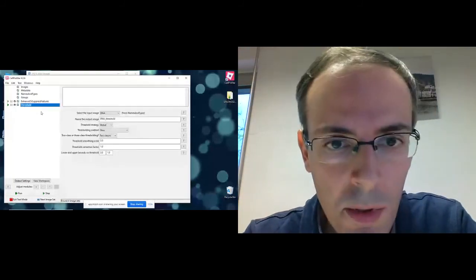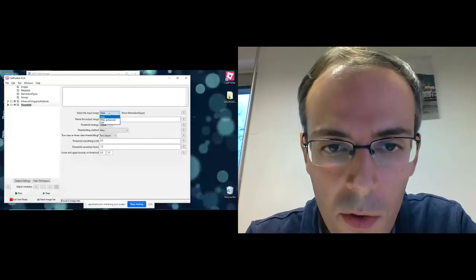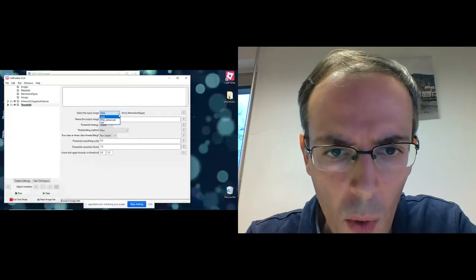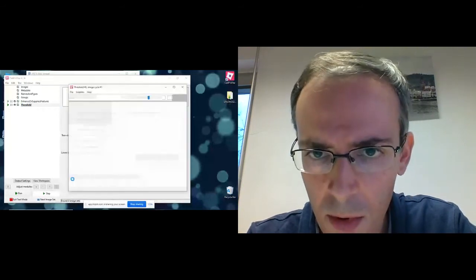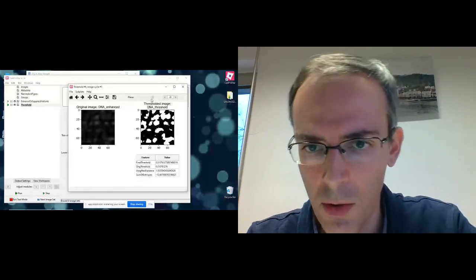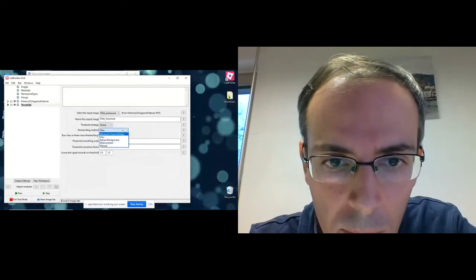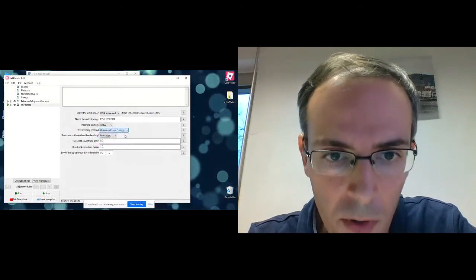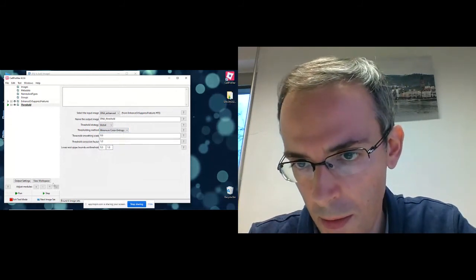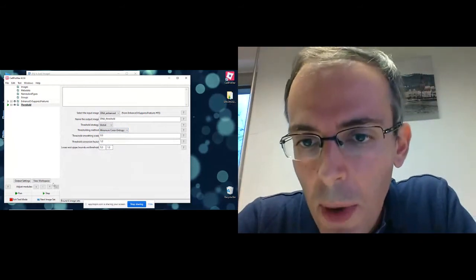So threshold. This time around, we don't want to threshold the raw DNA image. We would much rather want to threshold the DNA enhanced with the same parameters, maybe. It's not great. So I found that for the thresholding, the minimum cross entropy performs slightly better. Okay, at this point we only have a binary image.